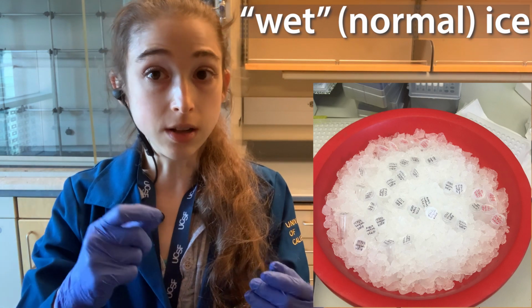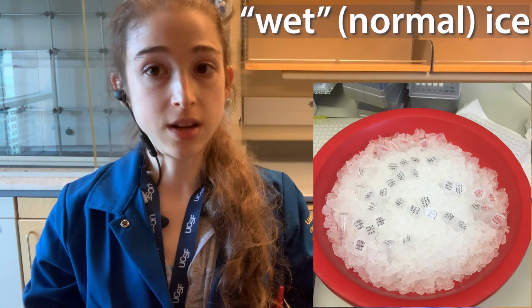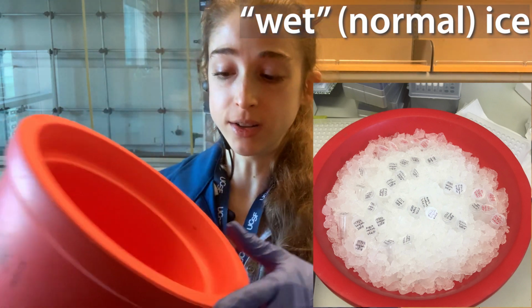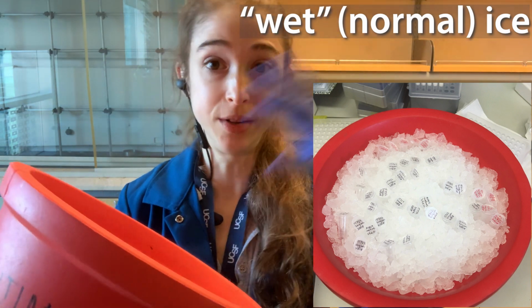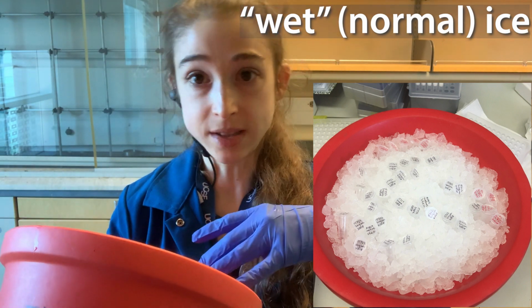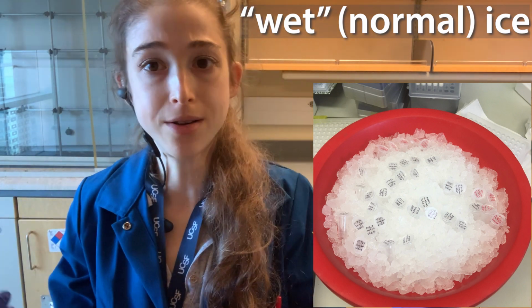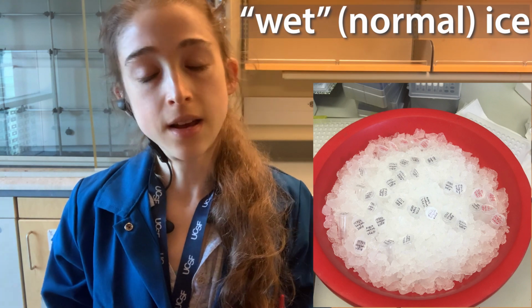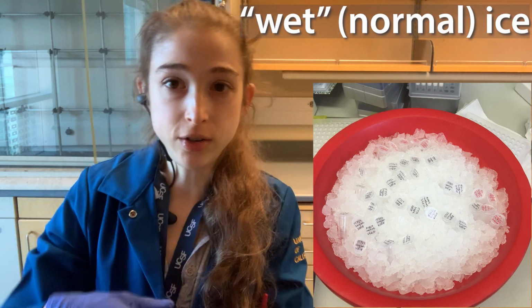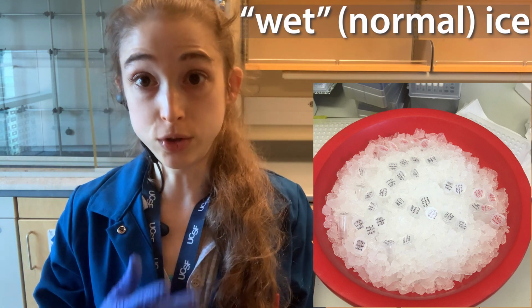Now when you're just working with little tubes in ice, those tubes can get lost in the ice, especially if you are trying to pour out the water from the ice and put in fresh ice. You can lose tubes. I've found so many tubes in the past, sometimes my own, in the sink because they go out with the ice. And when you're trying to cap the tubes in the ice, they can get pushed in. Yeah, it's a mess. So you want some way to hold your tube steady.